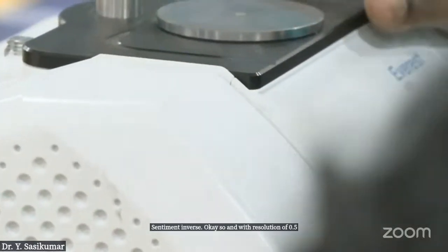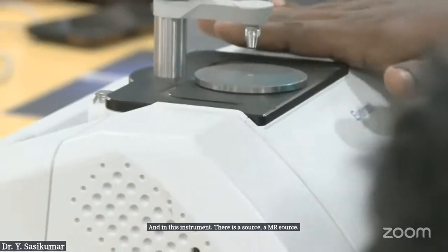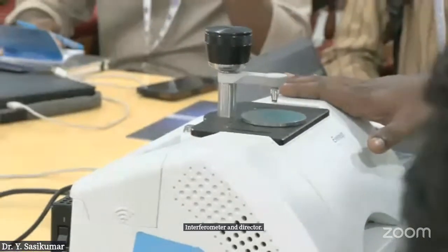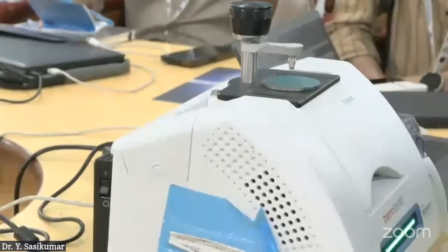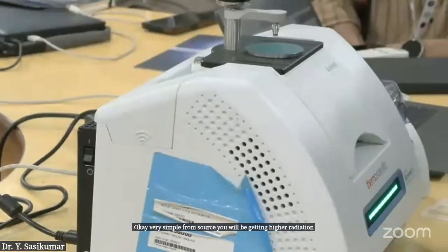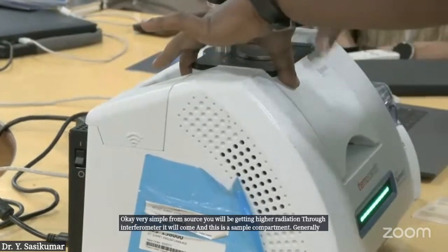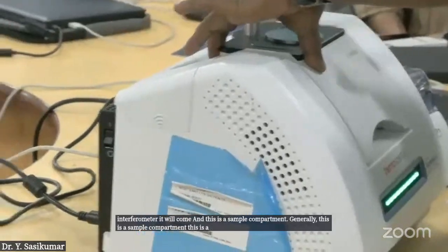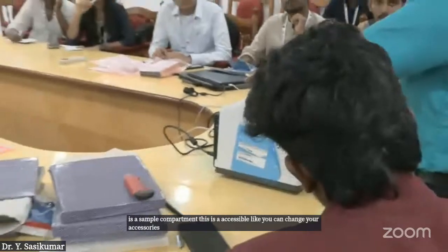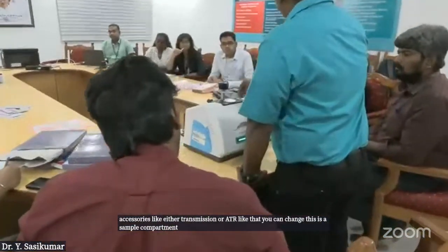And in this instrument there is a source, MIR source, interferometer, and detector. Okay, very simple. From the source you will be getting IR radiation. Through the interferometer it will come, and this is a sample compartment. This is accessible, so you can change your accessories, like either transmission or ATR. In the sample compartment you are going to keep your sample.